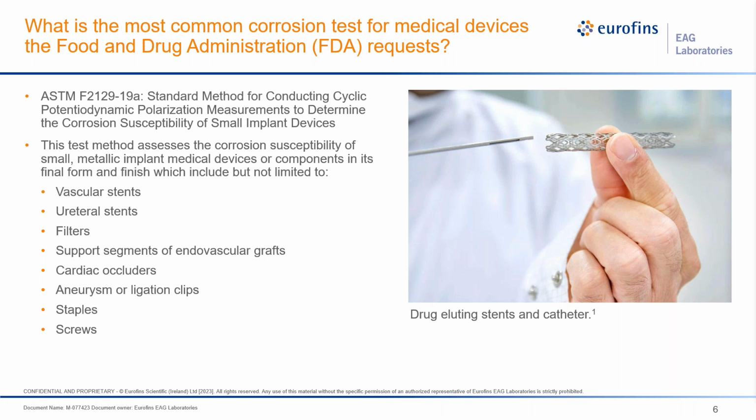The goal is to replicate the same conditions and environment the device will encounter in the field. The FDA recommends at least 6 samples to be tested to evaluate the known variability of corrosion performance. More samples may be needed depending on the corrosion testing performance of the device and the acceptance criteria that has been established by the medical device manufacturer.